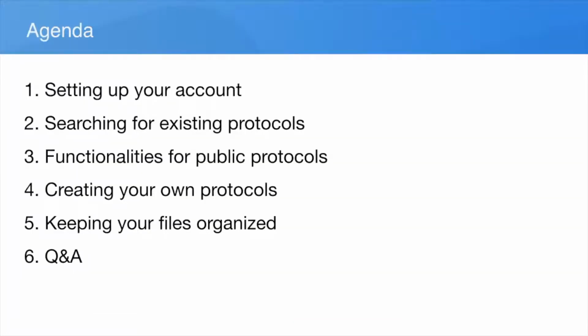And so the agenda for today is, first we're going to look into how to set up your account, and then I'm going to show you how you can search for existing protocols on the platform, so you can find things that might be relevant for your own research. Then I'm going to show you some of the functionalities on protocols, and then quickly I'm going to show you how you can create your own protocols and how you can share them with others or publish them. And then I'm going to show you how you can keep your files organized in our file manager. And then in the end, we have some time for questions if you guys have any questions.